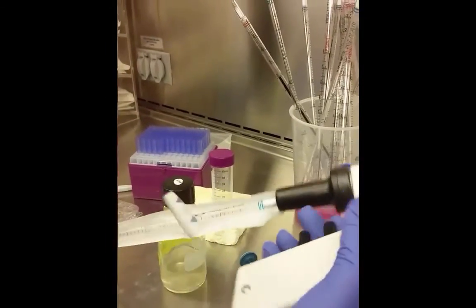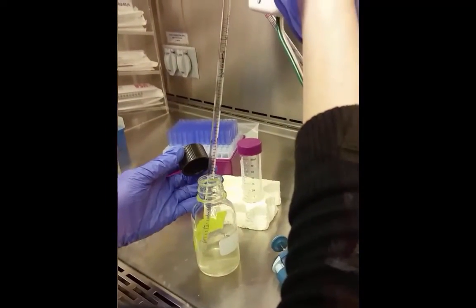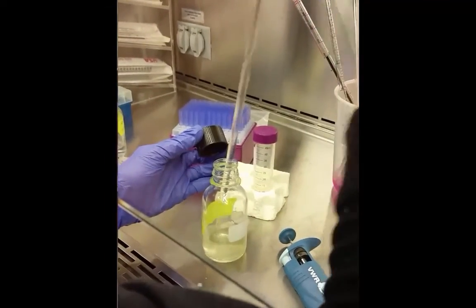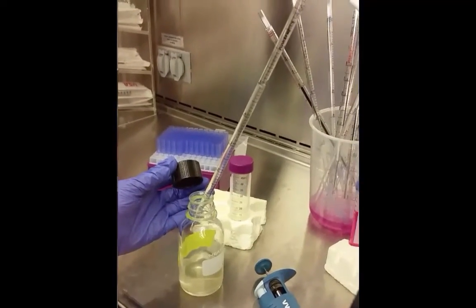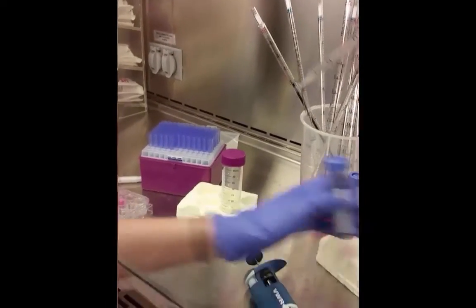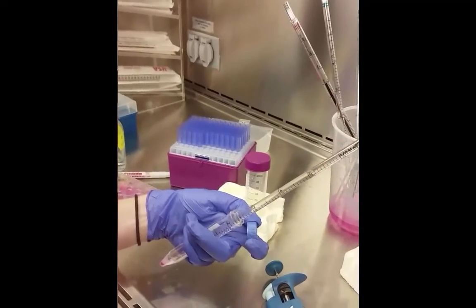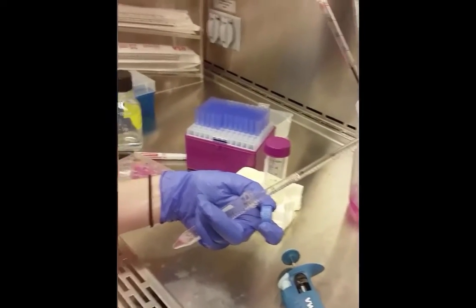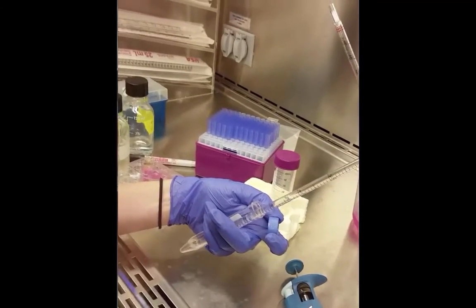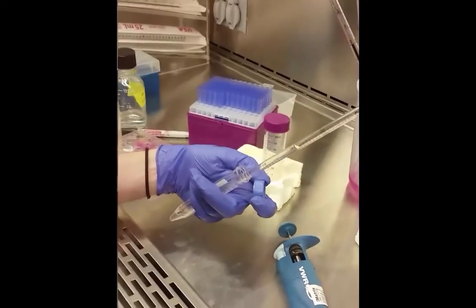And once you isolate your cell pellet, you want to get the appropriate volume of alginate solution into the serological pipette. And then you'll add it over top of your cell pellet. And now you want to uniformly distribute the cells in this alginate solution, so you'll gently pipette up and down several times.